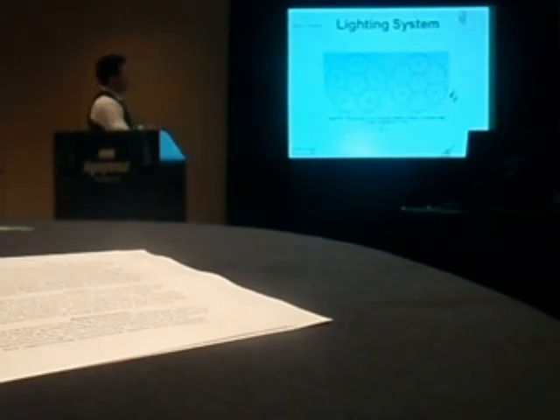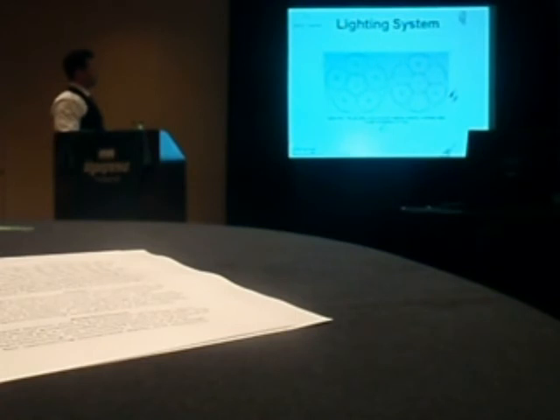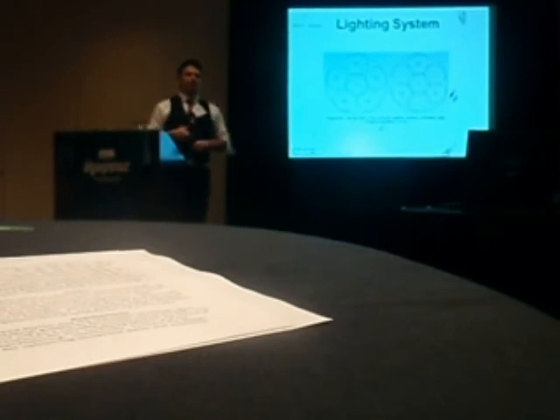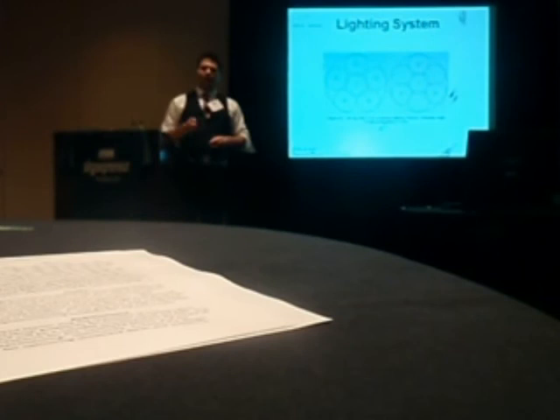So you can see it from the top view here of the lighting system. This one we modeled 5 and this one 3. And this is a 7.5 centimeter spacing between light and wall. That way you can optimize your LEDs to output the right power, so you get your correct light density as well.